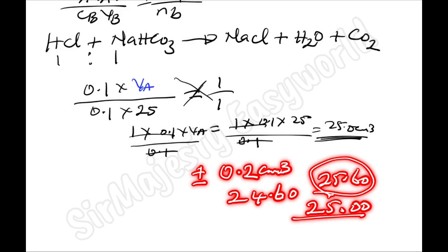So you are advised to be within the endpoint range, and this requires that if you have not trained your students well and there is no accurate apparatus, you will tell your students, maybe indirectly, the range of your endpoint. But students that are trained well will not vary with more than 0.2. My students don't vary, since your preparations are correct and accurate and your apparatus, your burette and pipette, are all perfect. So this is it for the end point.